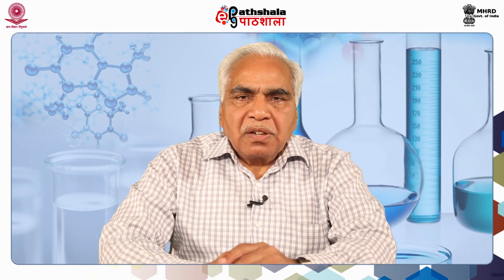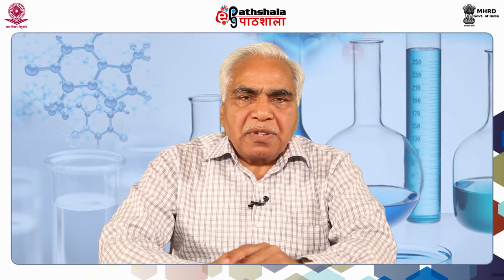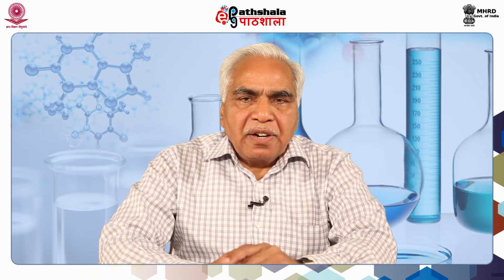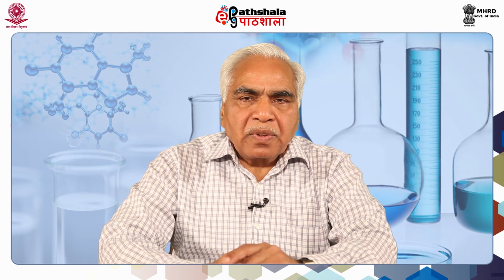Dear students, for understanding electron scanning microscopy, it is essential to understand instrumentation part as well as the principle on which this microscope works. By now, it should be clear that electrons instead of photons, as in case of light microscope, are used in scanning electron microscope.